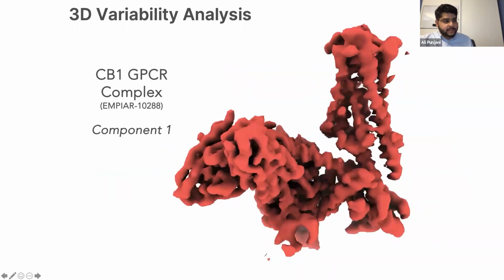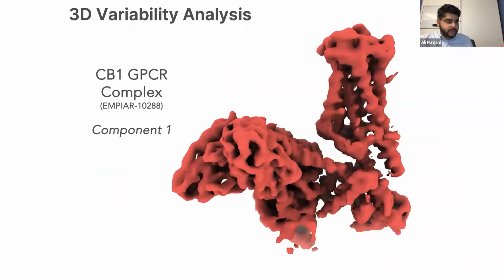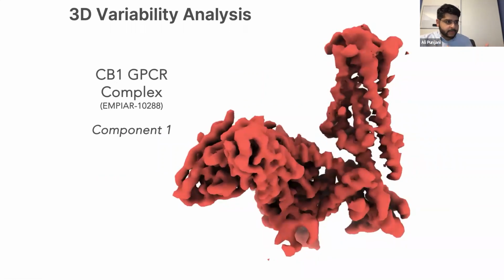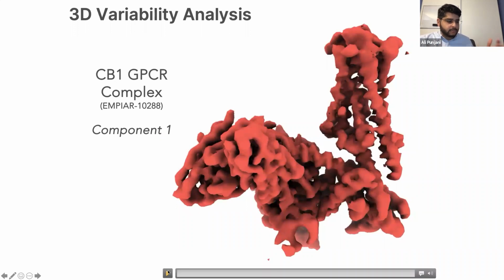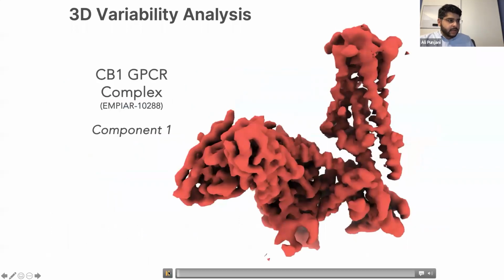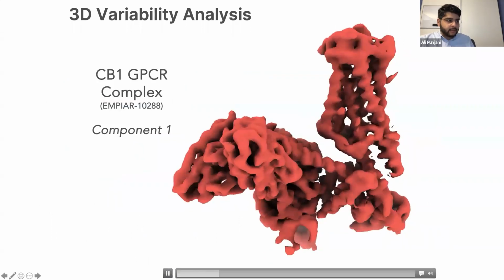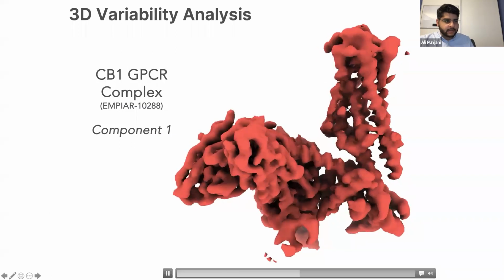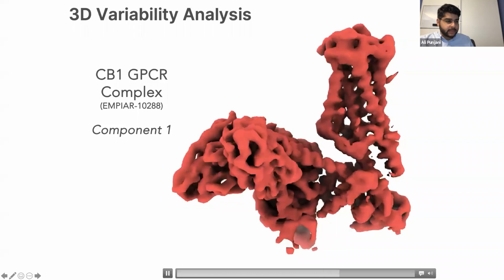And once again, this is a striking result for 2 reasons. One, because we're looking at the experimental motion dynamics of this molecule. This is not simulated by molecular dynamics or some other kind of model or normal modes or anything like that. This is actually what's happening in the electron microscope images. But the parts of the protein that are moving are very small. So this transmembrane domain now is less than 50 kilodaltons, less than even 40 kilodaltons, I think.